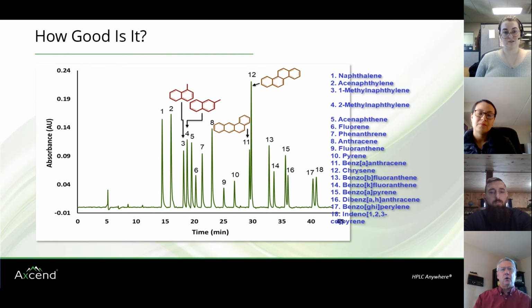Let me assure you that if you're a chromatographer, you look at this chromatogram and you think to yourself, boy, that's a great capillary GC run of a bunch of polyaromatic hydrocarbons. But the cool thing about this is it ain't GC. It's HPLC. You are not getting peaks like that from a 4.6 millimeter column, or frankly, even a 3 millimeter or a 1 millimeter column. Our column diameter is 0.15 to 0.3 millimeters, which gives us less band broadening, less expansion to the walls of the column. We get sharper peaks, more peaks, higher peaks.